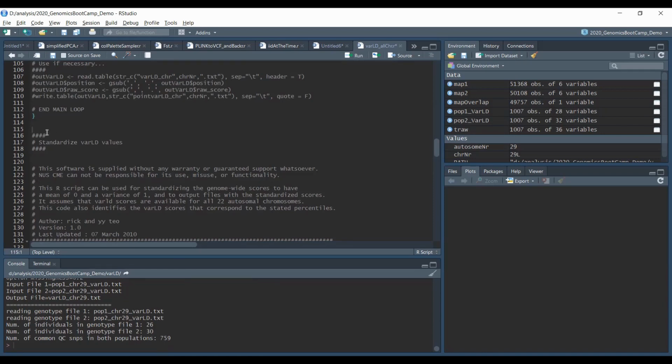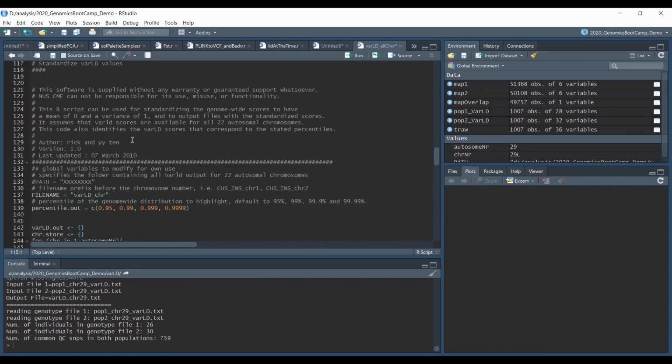I took this part directly from the varLD website. You remember I mentioned those 2 script files. Now this is their content, and I took their content and copied them directly here. So this is also the disclaimer. I did some changes, and the first change is just commenting out this line. You remember at the beginning of the script, I told you that I'm already implementing the working directory as variable path. That's because this variable path is also used in the script from the varLD authors.